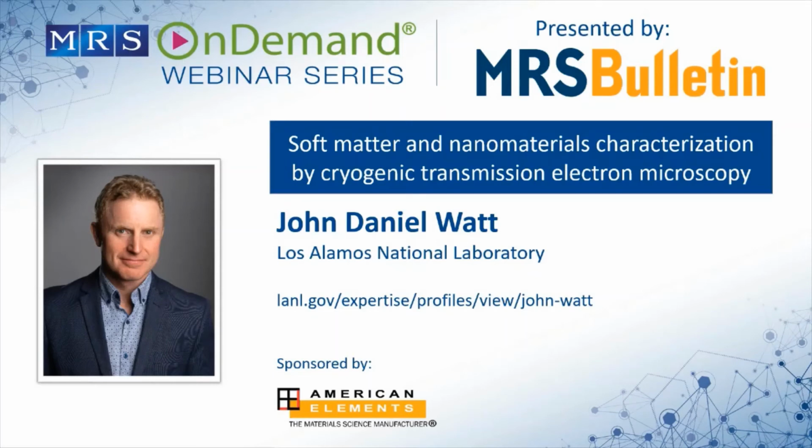Yeah, so that's a tricky one. The quick answer is plunge freezing your medium into liquid ethane, which has led to the development of the Vitrobot, the Thermo Fisher tool, but there are tools from different companies as well. And then once you have it plunge frozen, it's about doing all of your work under liquid nitrogen to maintain that vitreous ice background.